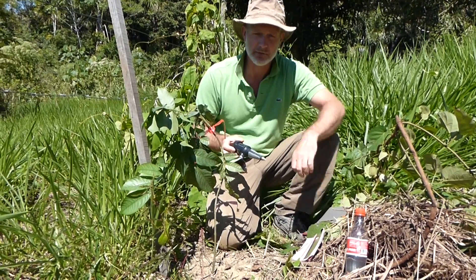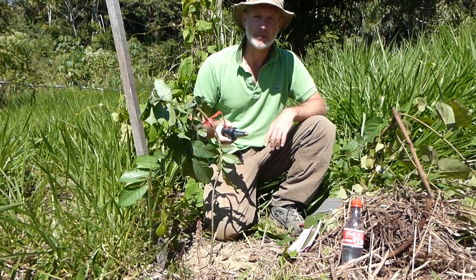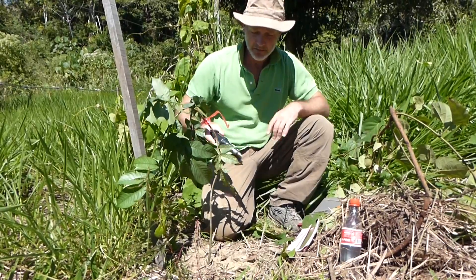The soils here are quite dry, which means we need to moisten them before we can get a good measure. So first of all I'm going to use the pH meter to make the correct sized hole.